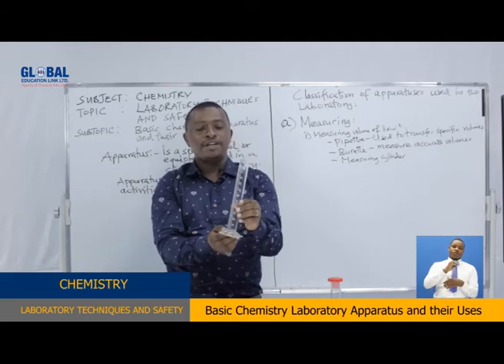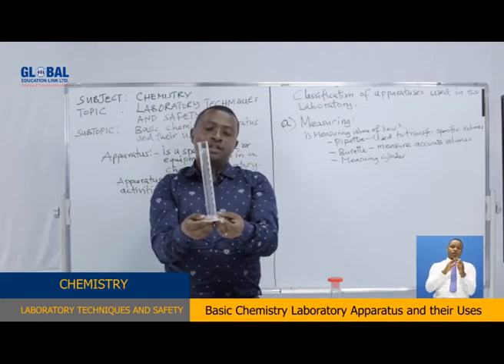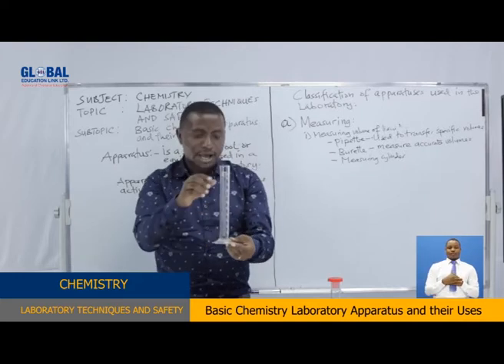So they have different sizes. And this one is made up of glass, so it's a glassware apparatus.